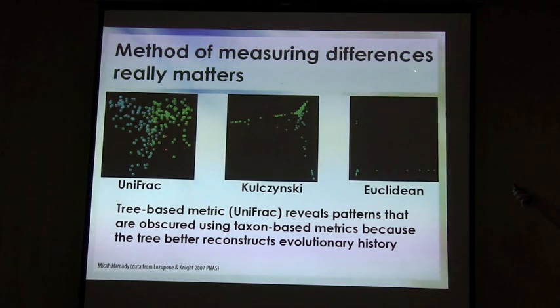And I'll point out that the method of measuring these differences really matters a lot. So here's a view using a slightly newer, slightly expanded data set on the same data I showed you before with UniFrac, with the saline, non-saline split and the estuaries in the middle.